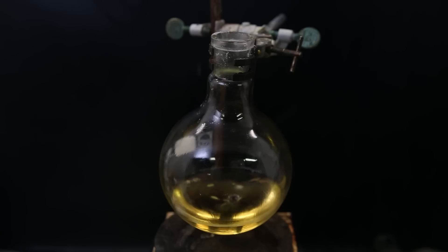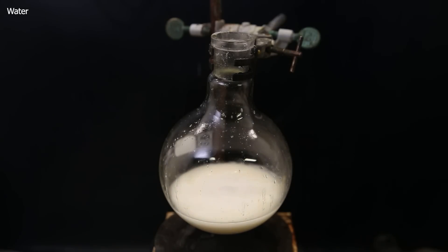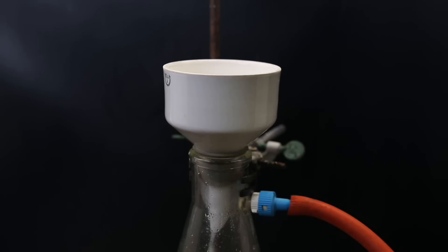I moved this yellow solution to a flask and then added water in which the product is insoluble, causing it to precipitate. So I keep adding water until nothing more precipitates. I then set it up for vacuum filtration again and collect the purified product.